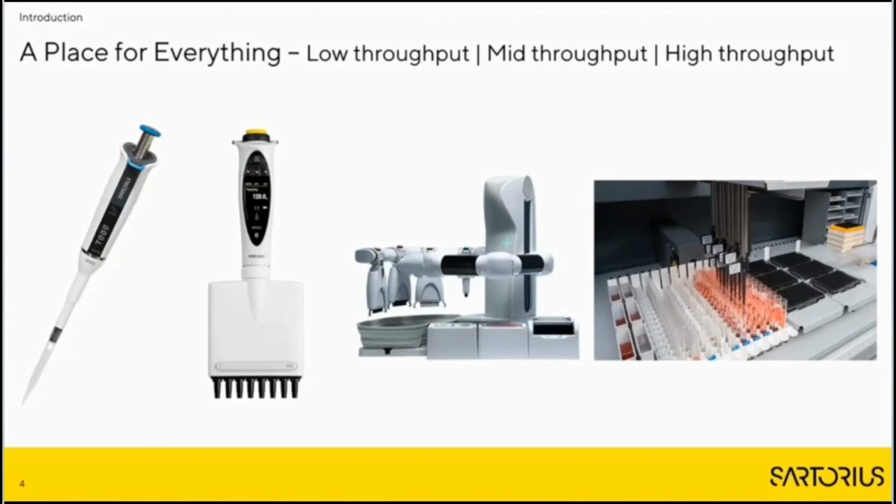Even if a lab has most of the liquid handling needs met by a robotic system, there are very commonly still certain things you need to do with manual pipettes. All the exceptions are typically handled by manual pipettes. Certain sample handling is still performed with manual pipettes, cherry picking, etc. So there's a place for various tools within a lab.